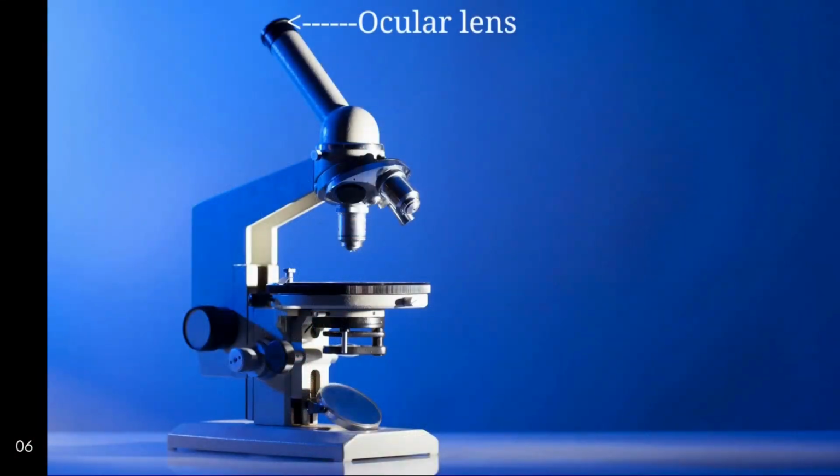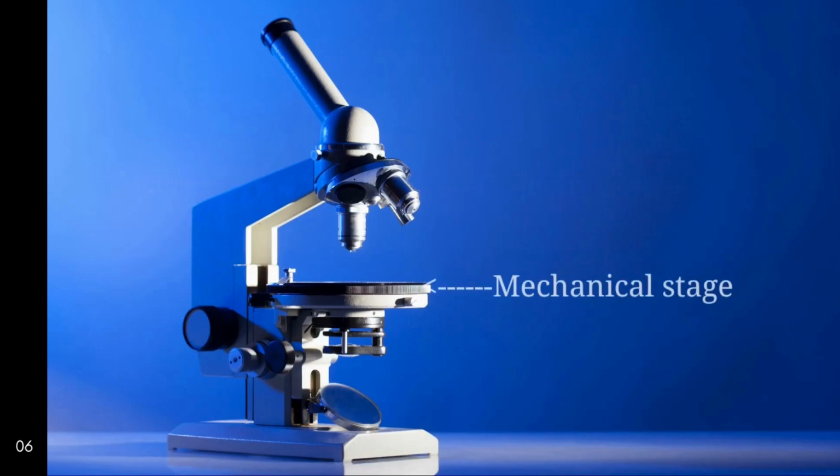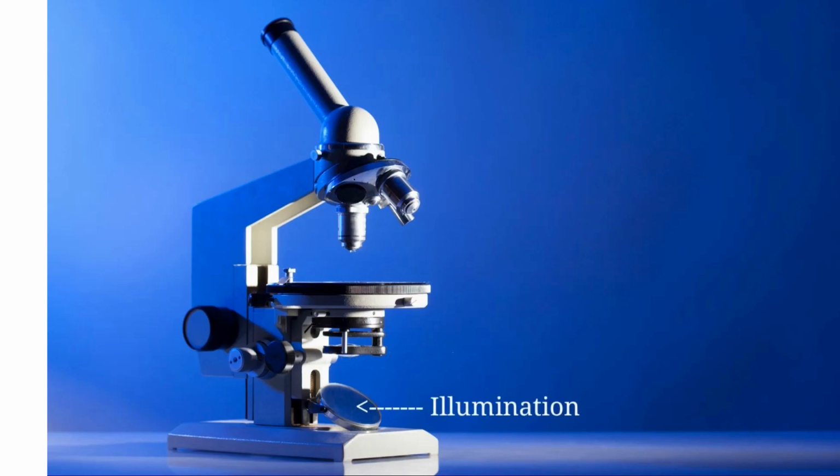Ocular lens. Arm. Objective lenses. Mechanical stage. Fine adjustment. Illumination. Stage.